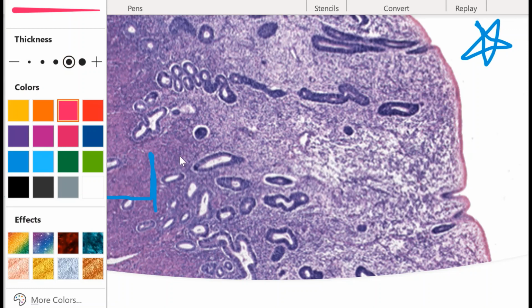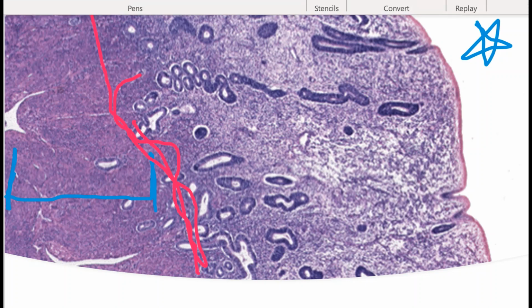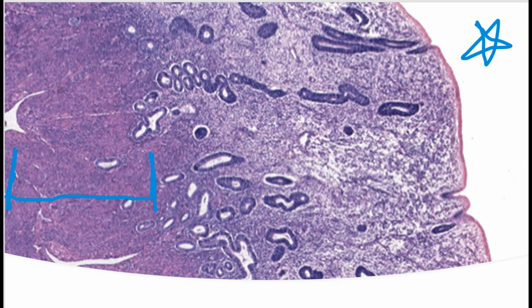Then we're going to have our endometrium. So do you see how this area right here kind of starts to get a little crazy with its color changing? Let me erase that because that's going to bother me. Sorry. So we're starting to get a little crazy with our color change, right? All of this is endometrium.